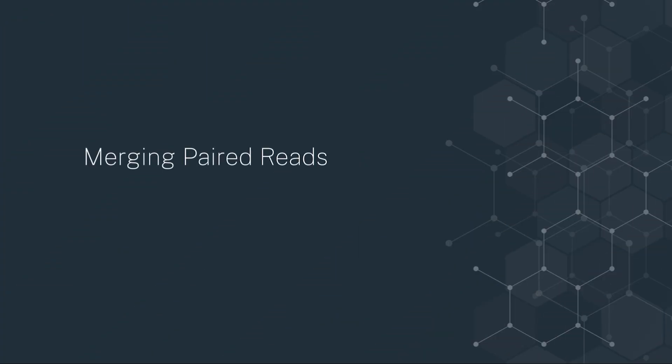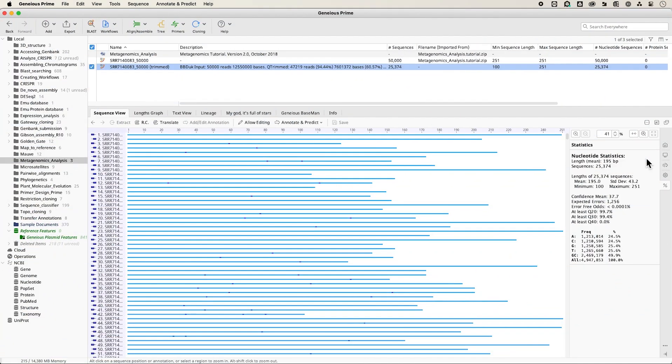As our reads are 250 base pairs, the forward and reverse reads overlap and can be merged to create a single consensus sequence for each pair. Merging reads is beneficial as it helps to increase the accuracy and reliability of the data, especially when dealing with short reads.